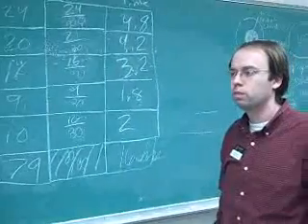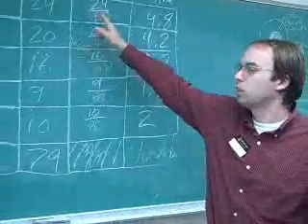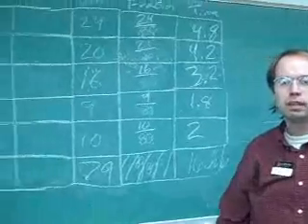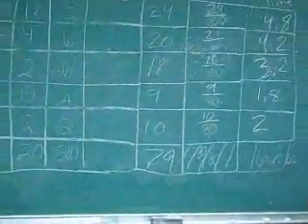Okay, so for your final exam with your quizzes, make sure you can do simple calculations just by multiplying the fraction of the cells in one particular phase by the total length of time it takes. That is 16 hours for allium. Okay, let's walk on over and see our last experiment.